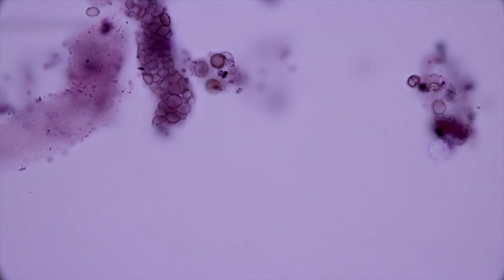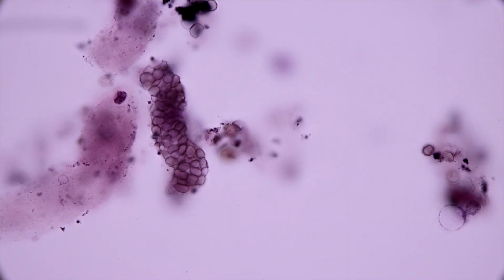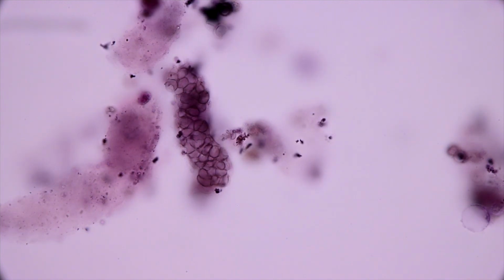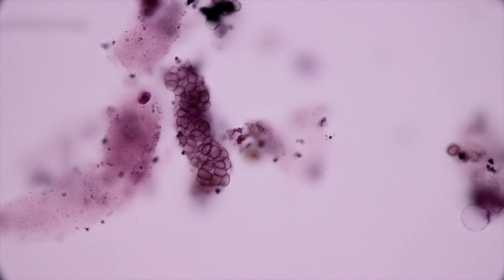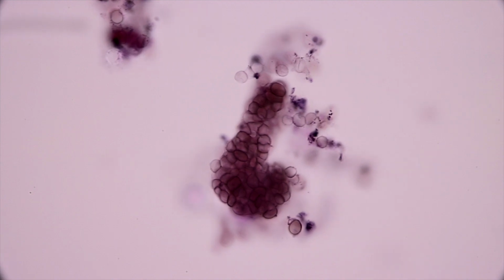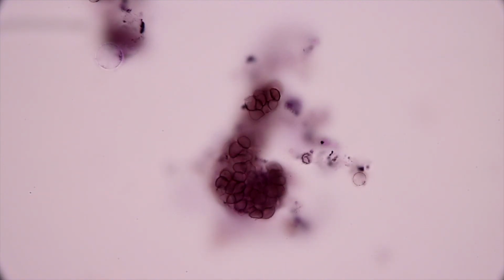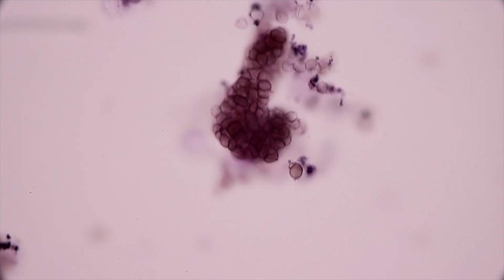Now scanning in a different area of the same slide, we come across several red blood cell casts, some hyaline casts, and some scattered cells. Focusing up and down, we can see what's within the interior of this cast. Here we have another red blood cell cast. They're packed so tightly you can hardly see the protein matrix surrounding the red blood cells.